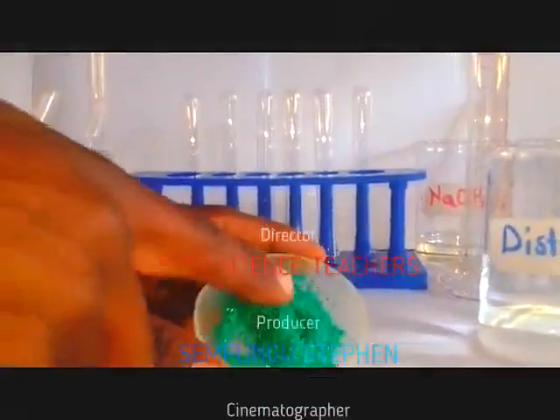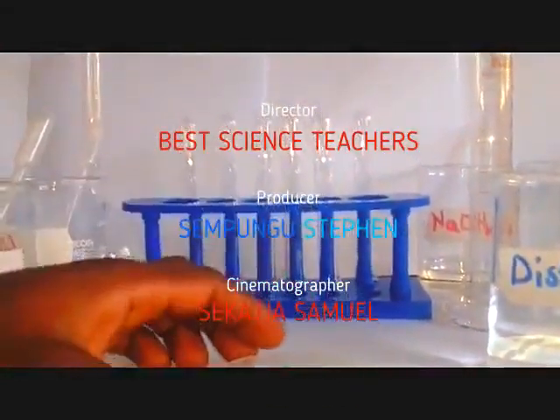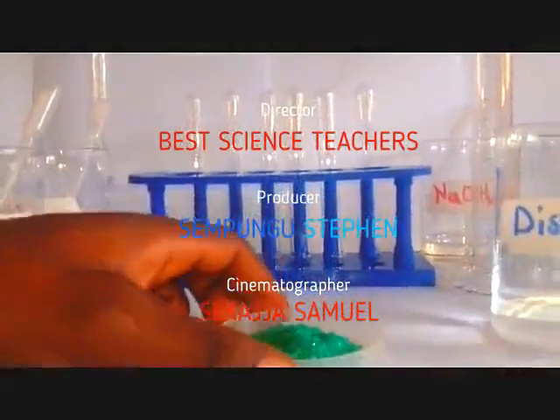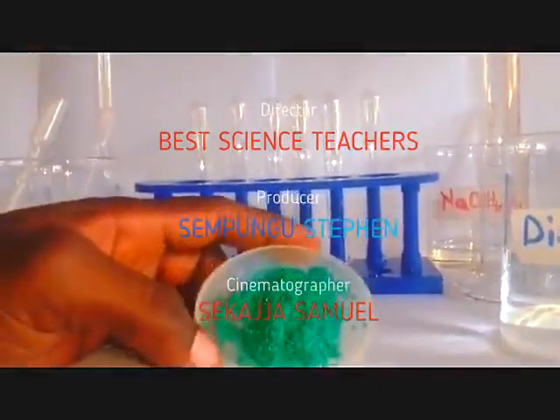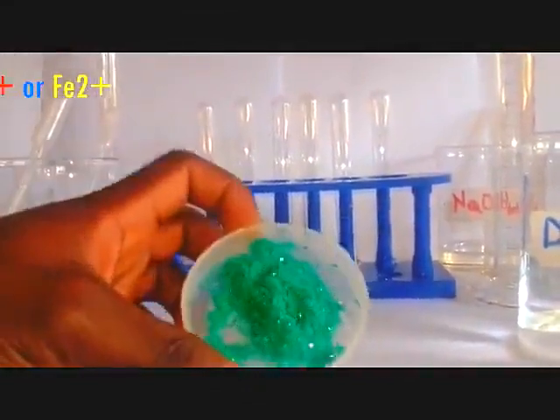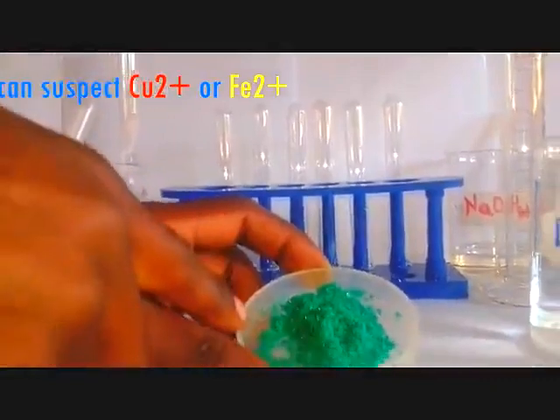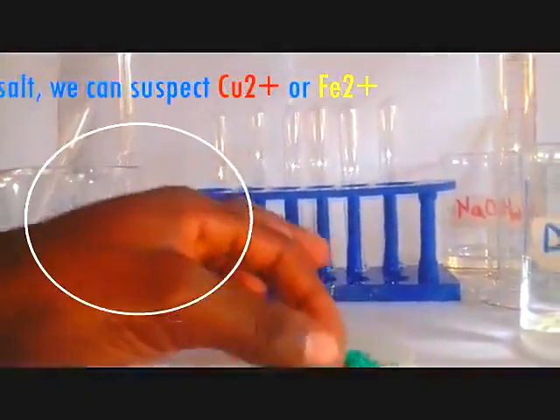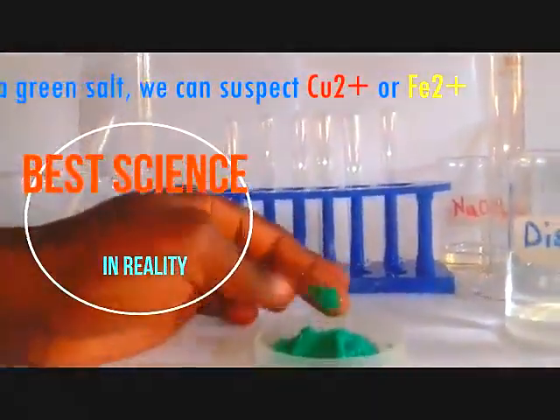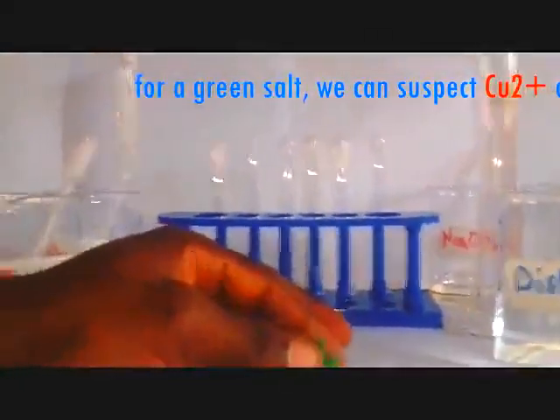It is green in color, and before you do any practical, you need to do what we call a preliminary test. First of all, you have to see the color. Seeing the sample, since it is green, we can suspect it can be a sort of copper or a sort of iron. So you can say that maybe copper 2 and iron 2 ions are present.